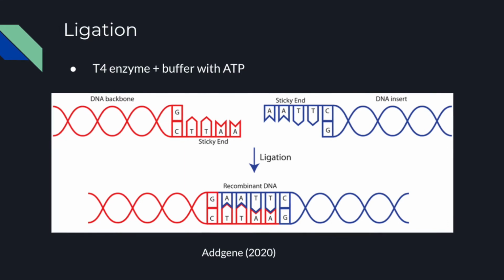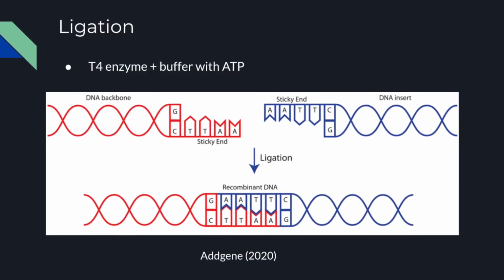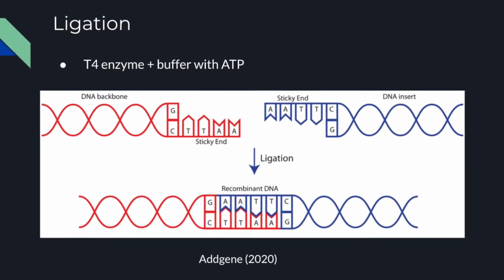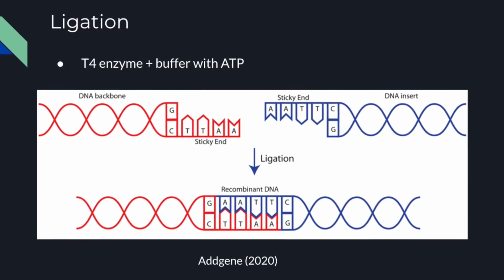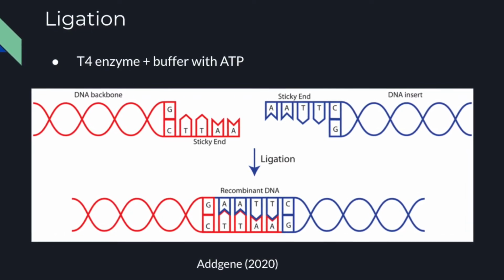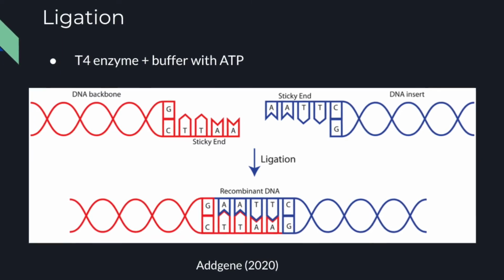To make an effective ligation process, it's important to consider a high enough concentration of DNA and the proper ratio between the vector and the gene, which is approximately 1 to 3, to make sure that the ligation will occur properly. Also, the agarose electrophoresis and the double digestion, which are our previous steps, are essential to increase the ligation efficiency.